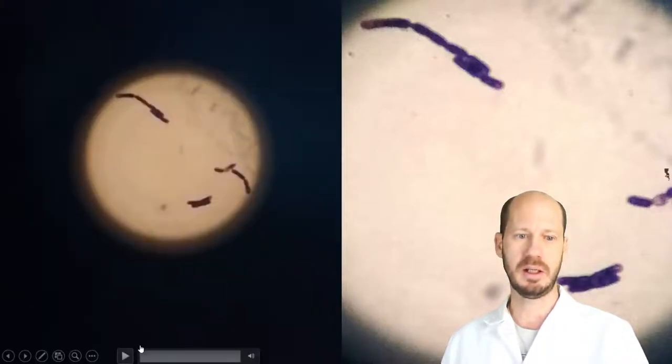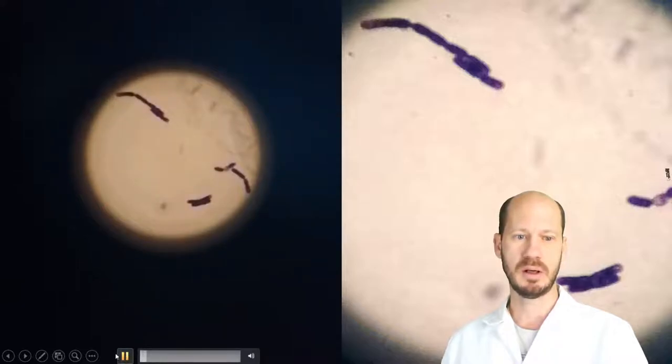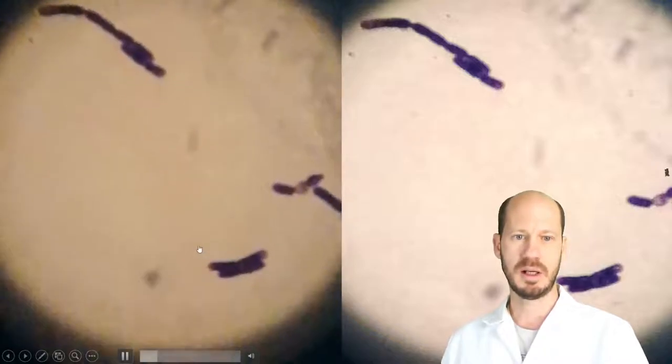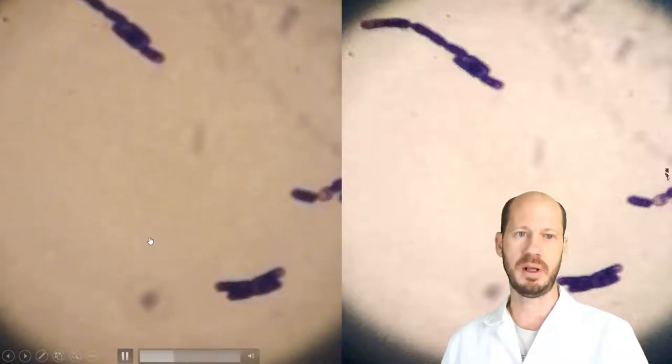Let's look a little bit more. Another slide here. Just the focusing process of these cells that we took from our agar plates.